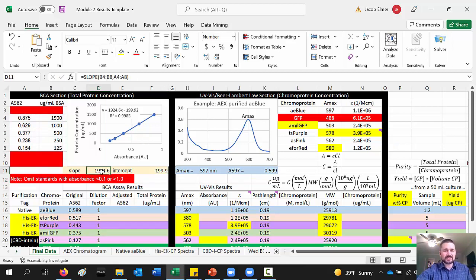Okay, so that's just nice because now we've got these numbers. We didn't have to retype them or transpose them from this equation up here down to here. Okay, so now we have this standard curve that describes how we can convert an absorbance value into a protein concentration. All right, so now let's do that with the values that we measured in lab.